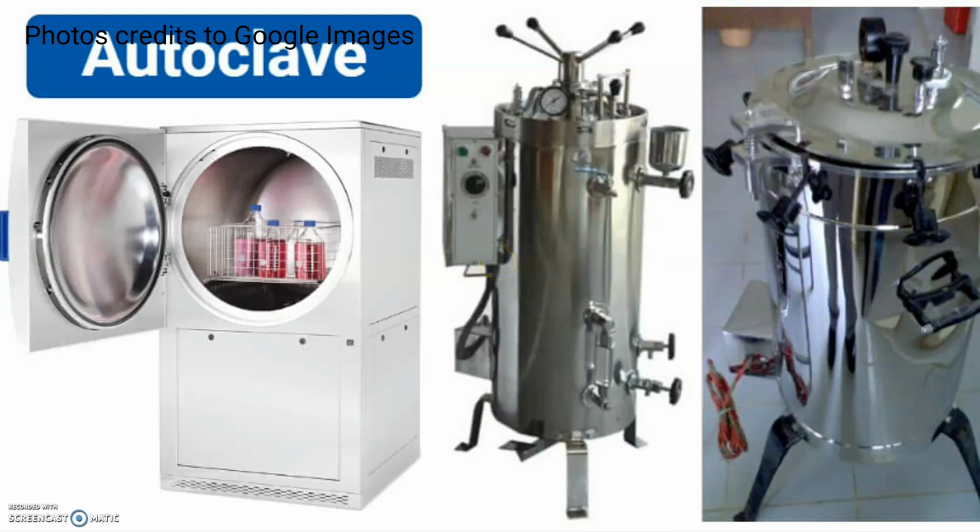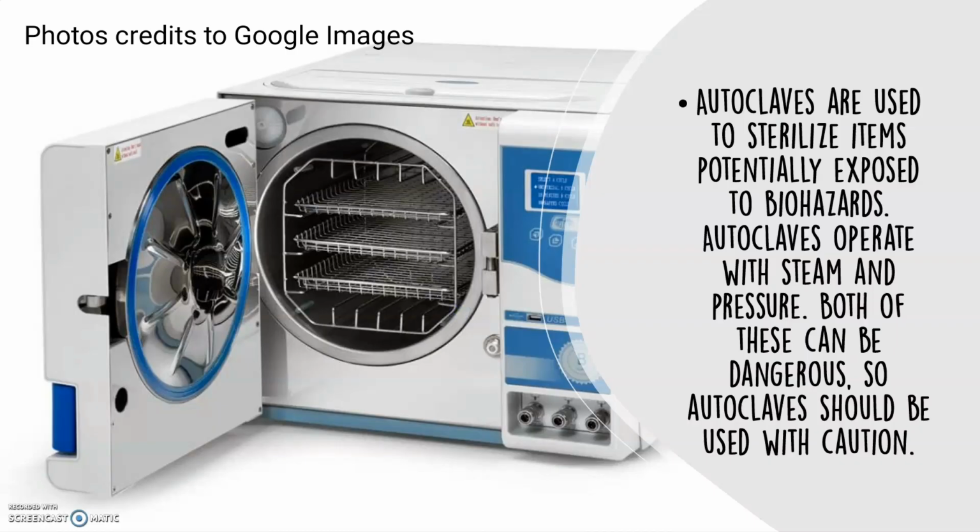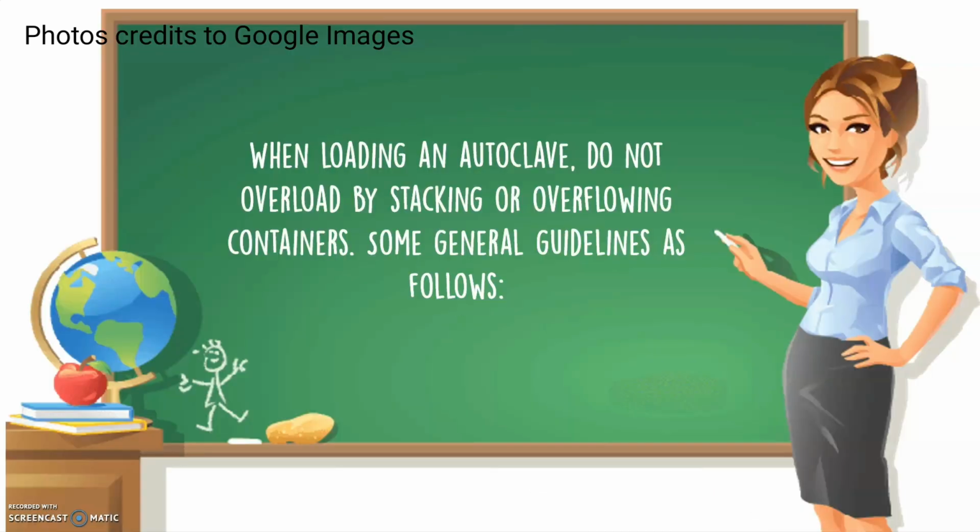This is an autoclave. Autoclaves are used to sterilize items potentially exposed to biohazards. Autoclaves operate with steam and pressure. Both of these can be dangerous, so autoclaves should be used with caution. When loading an autoclave, do not overload by stacking or overflowing containers.